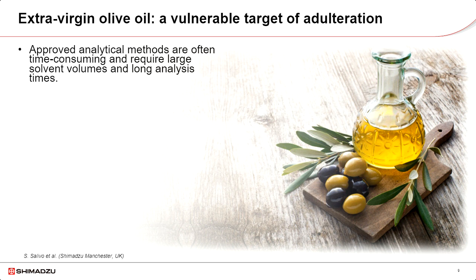To combat EVO frauds, rigorous and efficient quality control assays have been established to protect the identity of this unique product. Approved chromatographic analytical methods based on triacylglycerols and sterol profiles by HPLC and GC are quite popular. However, these methods often have the drawback of requiring time-consuming extractions, large solvent volumes, and long analysis time. Therefore, it is becoming increasingly important to simplify and speed up these analysis methods, while at the same time guaranteeing the quality and robustness of the data.